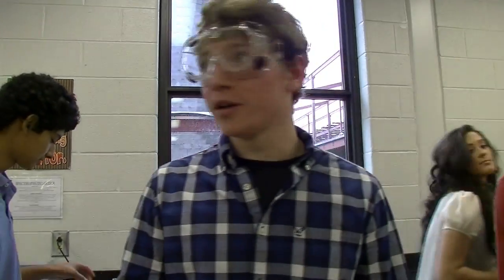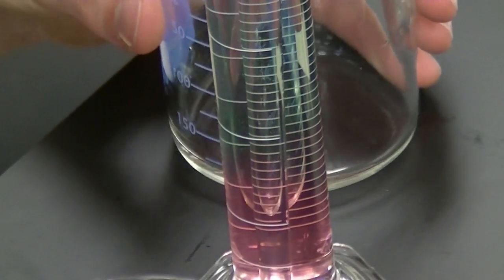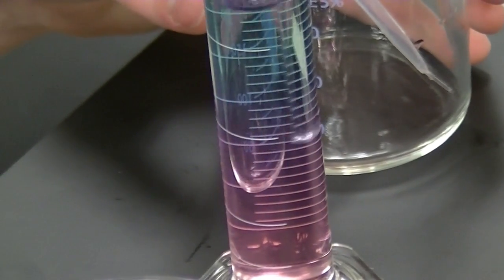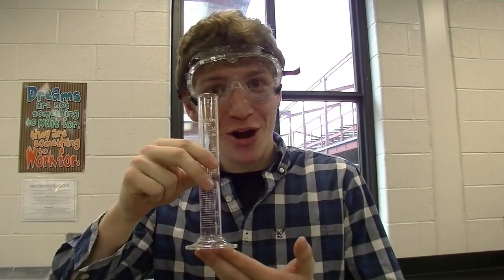Right now we have to dilute a 3 molar HCl, which is an acid, down to a 2 molar acid and a 1 molar acid. Then we have to titrate the 1 molar acid with a 0.3 molar base to create a purple color mixture.